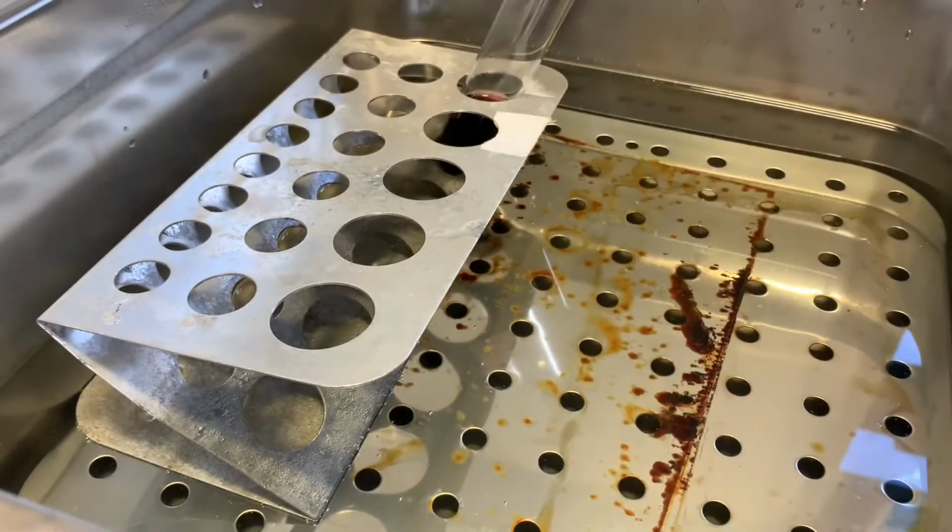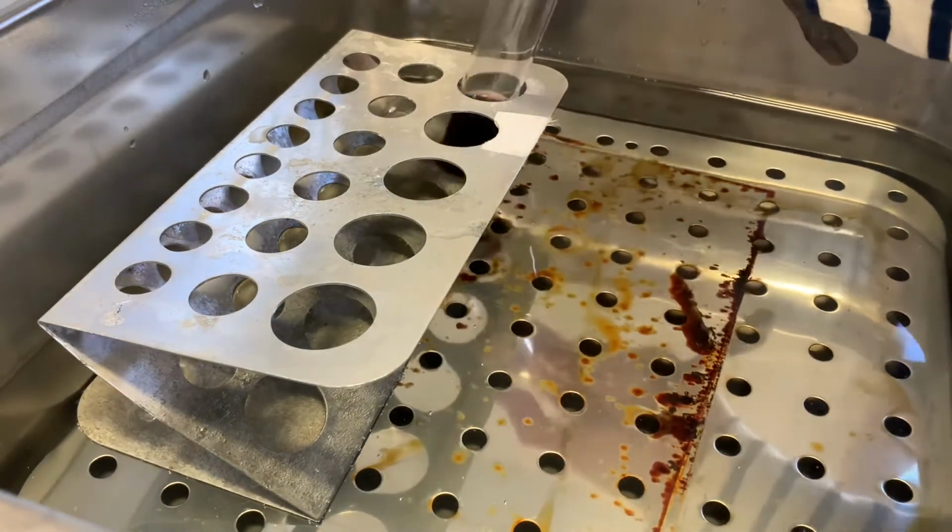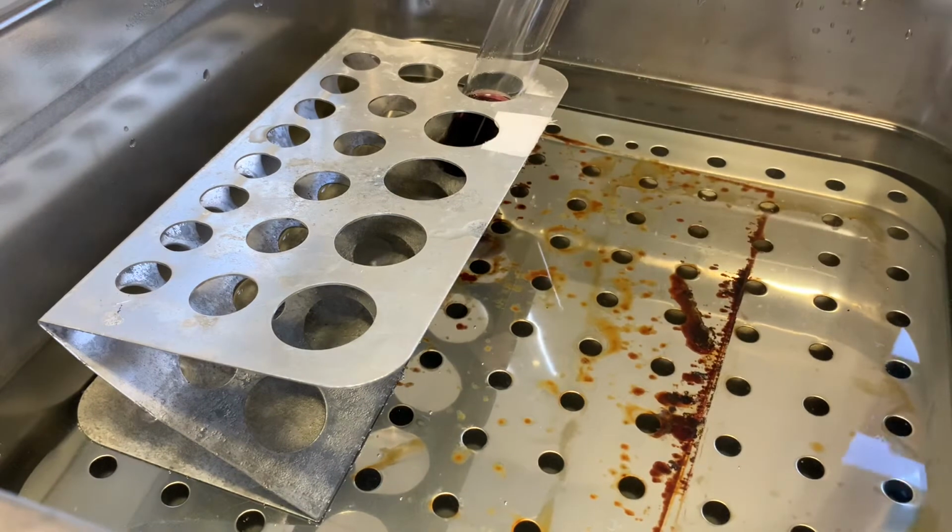Now what I've got in the water bath here is some grape juice. I've had that warming to 37 degrees because yeast is obviously a living organism and it will function better at a warmer temperature. So what I'm going to do is add a sample of yeast to my grape juice, because my grape juice is the source of the sugar for the yeast to feed on.